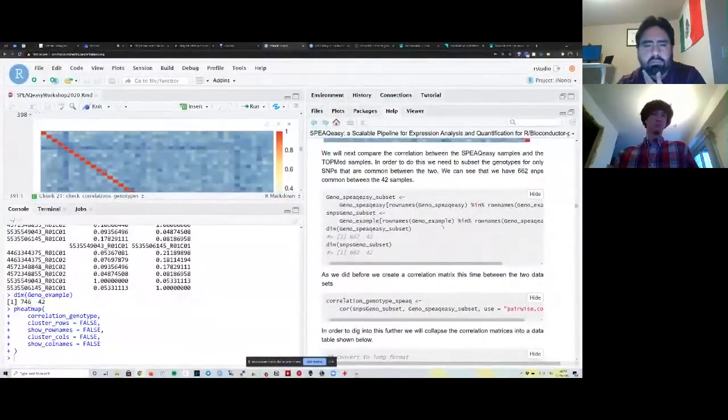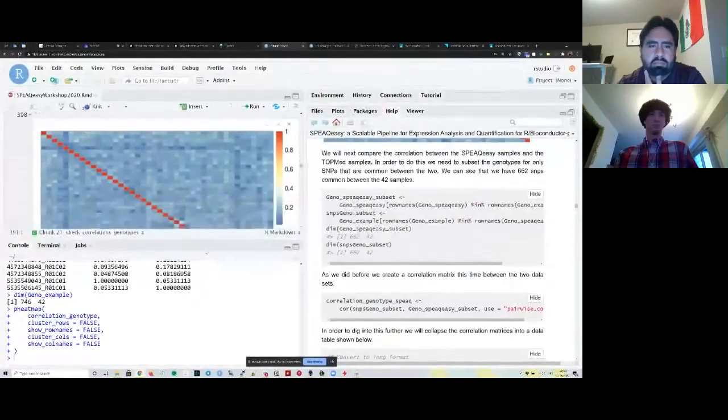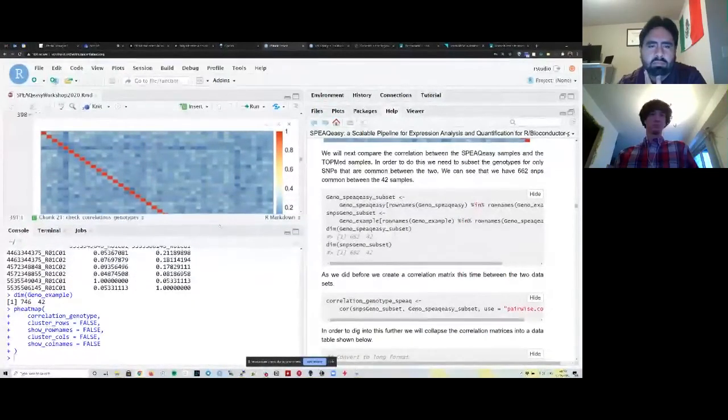Can I ask a question here, Leo? So we've got a case where maybe there's transplant cells and host cells. Will this be sufficient to discriminate the genotype of those two individuals so you can determine which is which in an RNA-seq experiment? It could potentially help you do that.